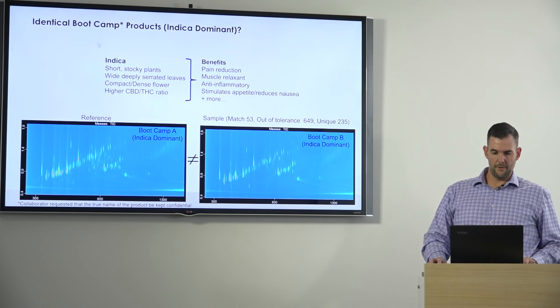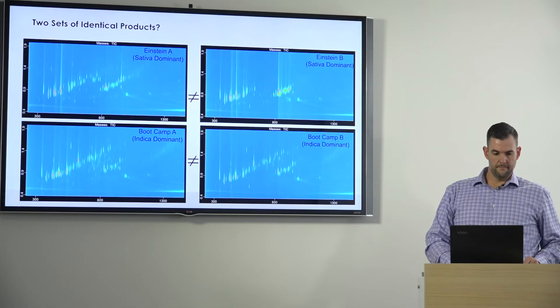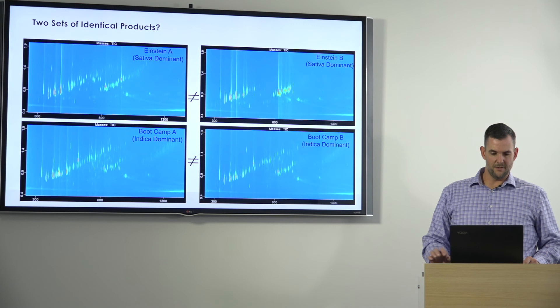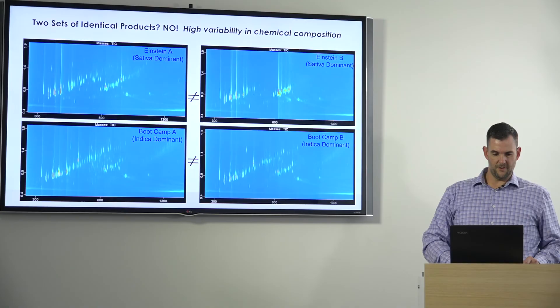Looking at another product — the Boot Camp strain — they look a lot more similar visually than the Einstein variety, but again the software tells us there are 53 matches, almost 650 analytes out of tolerance, and 235 that are unique to one sample. So again, these plants that are supposed to be very similar are chemically very different. We had two sets of identical products that we compared, and by looking at this chemical fingerprint they are very different — highly variable in their chemical composition.